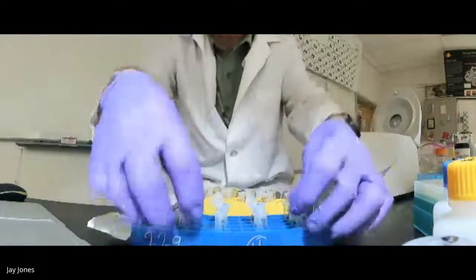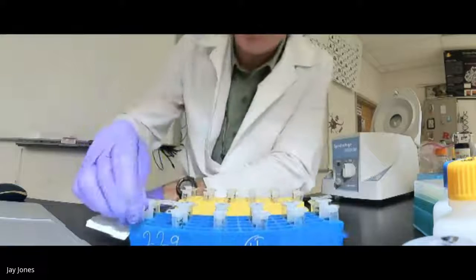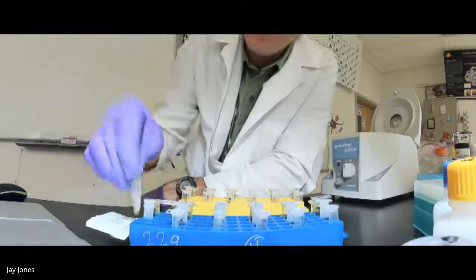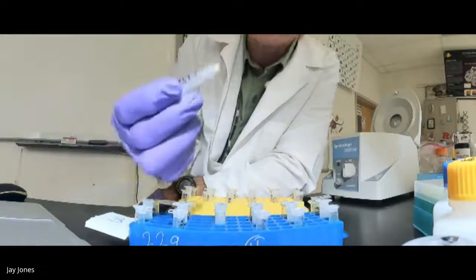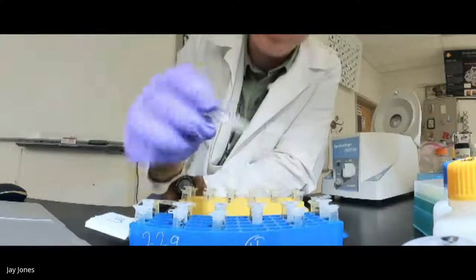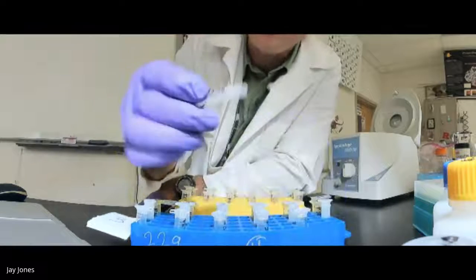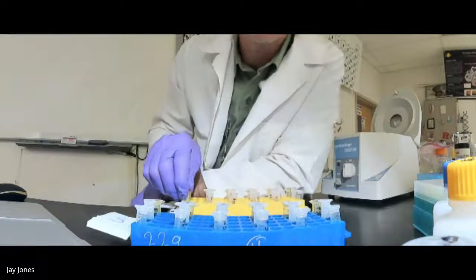Now solution two is a soap. It's sodium dodecyl sulfate. I'm going to invert every single one about five times. Solution two is a soap. It's basic. All soaps are basic, even hand soap at home. Sodium palmitate, sodium cocoate. Listen to those words, sodium cocoate.